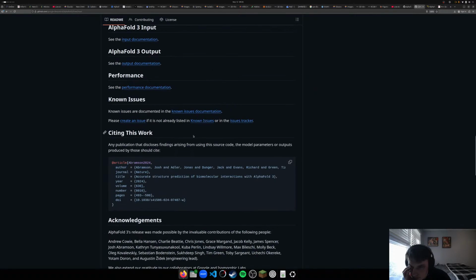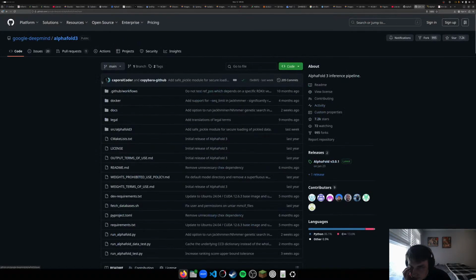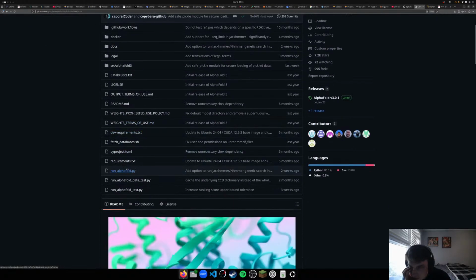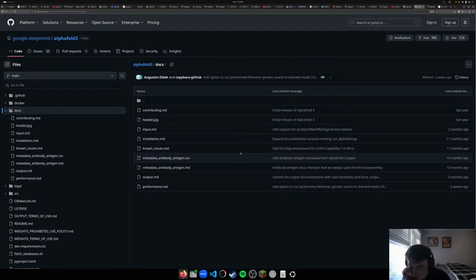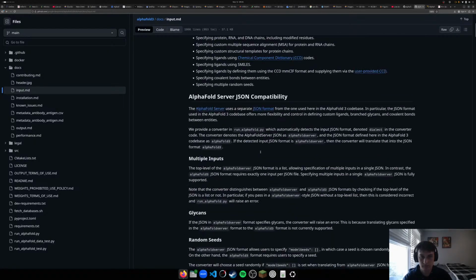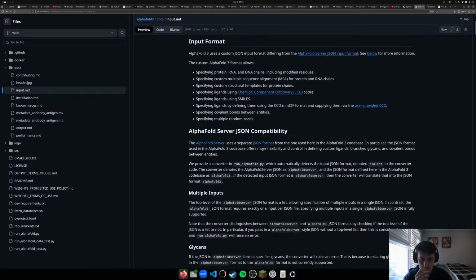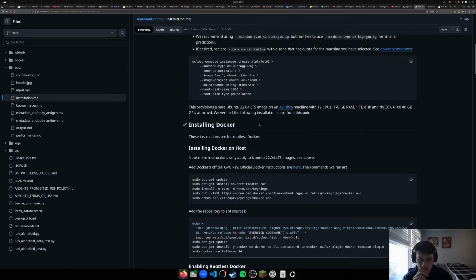Is it model directory? Docs, input. Installation.